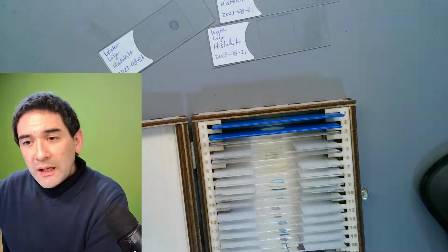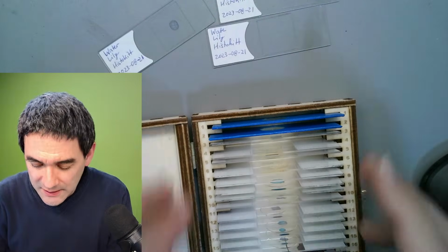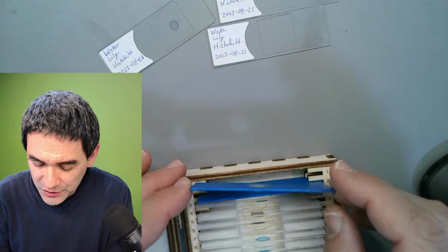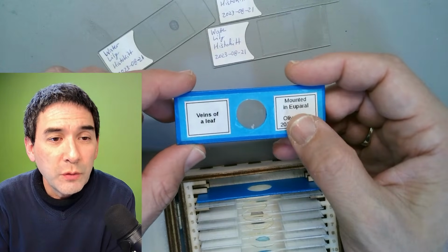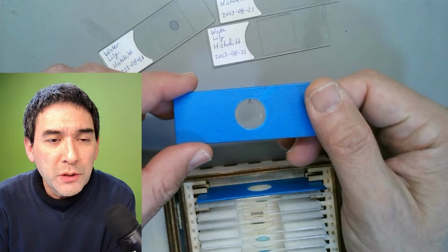Okay, let's have a look. I just want to show you first something that I tried to make several years ago. It's already over 10 years ago. This is a so-called paper-covered slide.